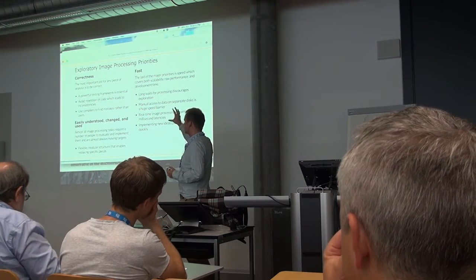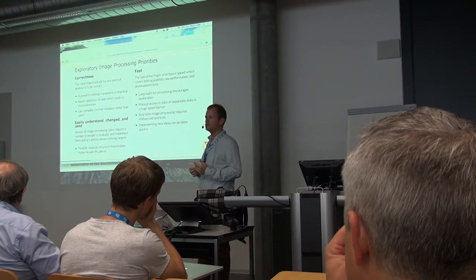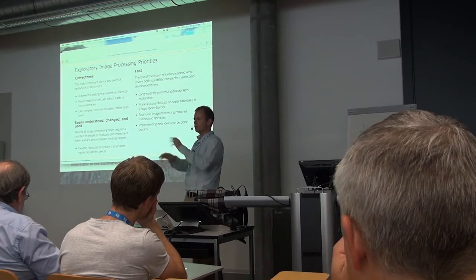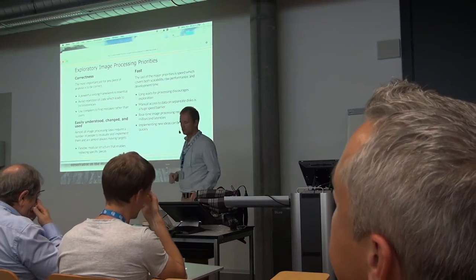The second is sort of fitting into that, and that's being easily understood, changed, and used. We find out with a lot of the samples we analyze that what we thought we wanted to know is very different at the end than it was at the beginning. So having something where you can quickly switch out parts and change the analysis makes your life much easier and causes you to play with it much more.